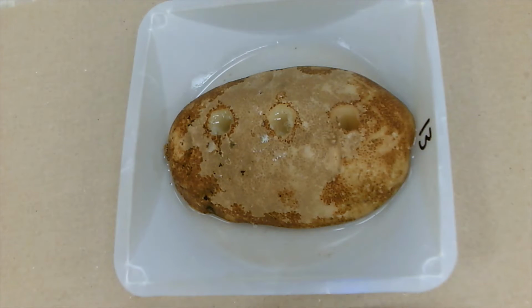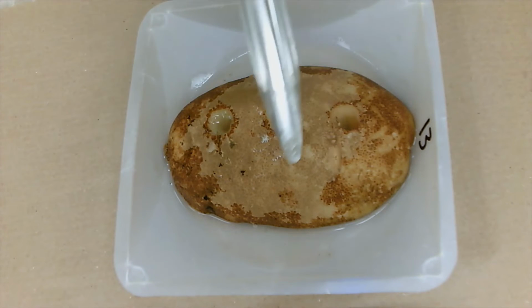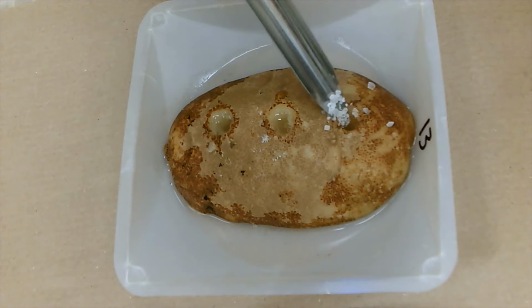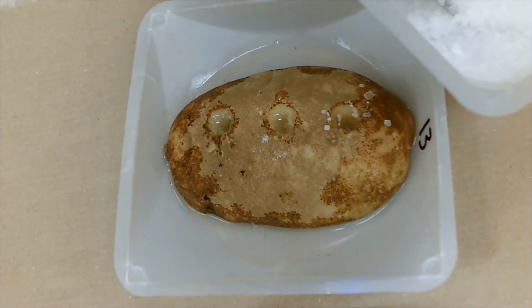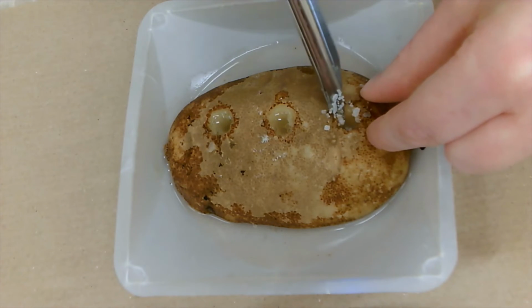And then in the last hole, you're going to be taking your coarse salt and you're going to be pouring, it's actually much easier if you use your scoopula and just scoop it into the hole, but make sure that the salt does not go into the distilled water. So you want the salt to go in here.